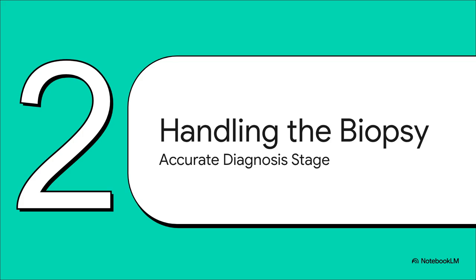So that brings us to handling the actual biopsy. Before you even think about putting a slide on the microscope stage, the choices made right there at the grossing bench are setting you up for success or for failure. Getting this part right is the foundation for the entire diagnosis.